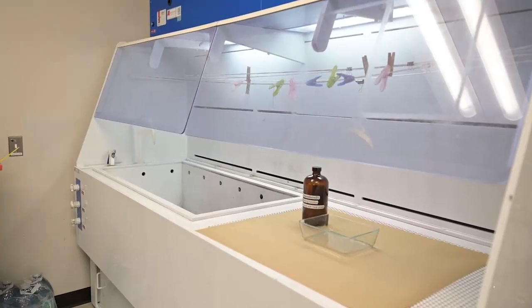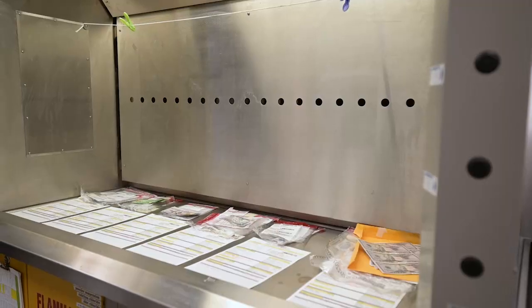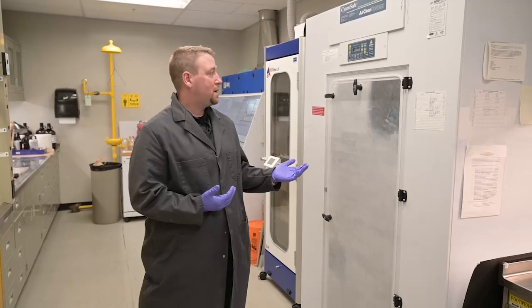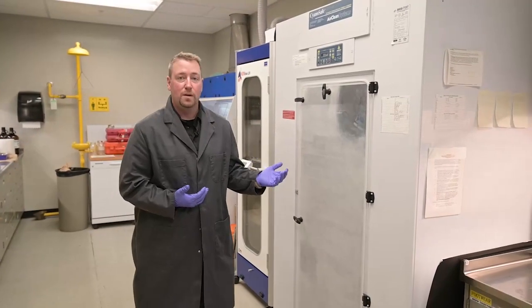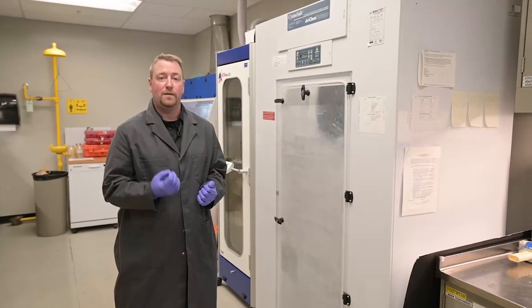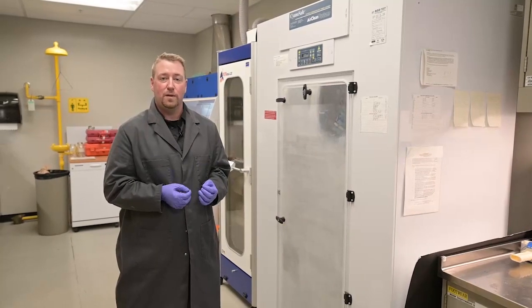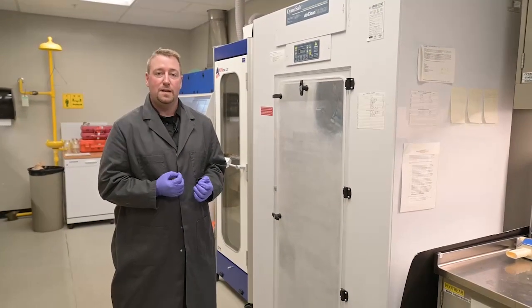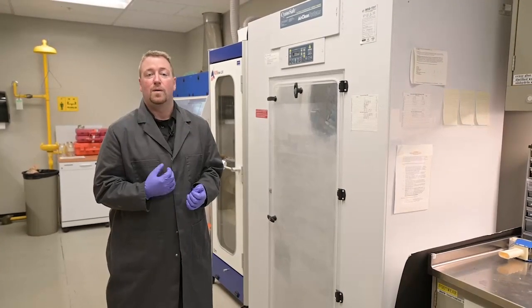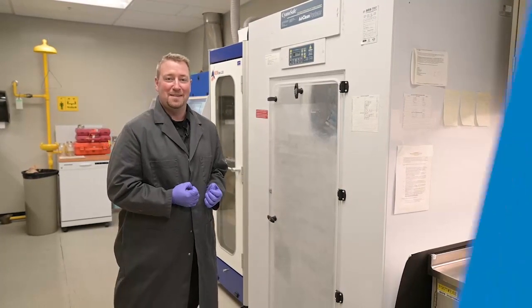Here we are in our chemistry lab. We have a lot of highly specialized equipment that we use to process evidence that allows us to visualize fingerprints we wouldn't normally be able to see. This particular piece of equipment is our glue fume chamber, or cyanoacrylate. What it does is it evaporates glue and water and mixes them in the air, and it actually sticks to the oils in the fingerprints that are left behind. We can use a dye stain and view it under a high-powered laser, and it allows us to see these fingerprints. Once we develop a fingerprint, we send it to our AFIS branch, and that's when the magic happens.